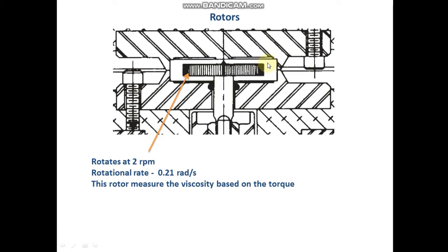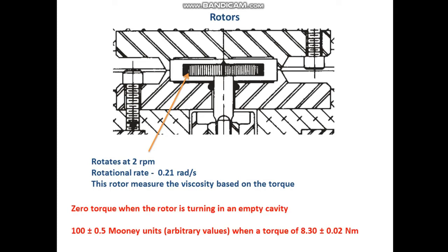We load our rubber sample to the cavity, then close the upper die, then apply a temperature of 100°C, and start the Mooney viscometer — meaning the rotor will start to rotate at 2 rpm. It tries to keep 2 rpm always throughout the test, and it will measure the Mooney viscosity and stress relaxation of the rubber sample. After measuring the Mooney viscosity, to measure the stress relaxation properties we need to stop the rotation of the rotor suddenly, then we can record the stress relaxation.